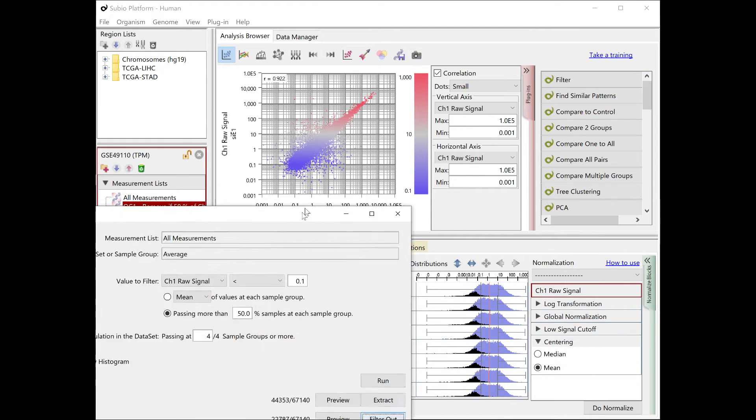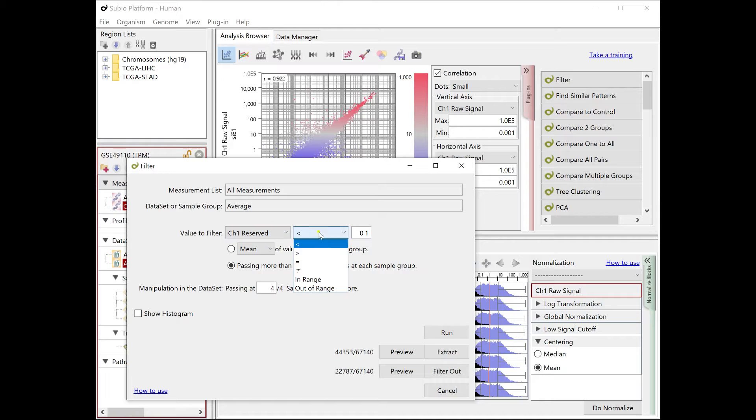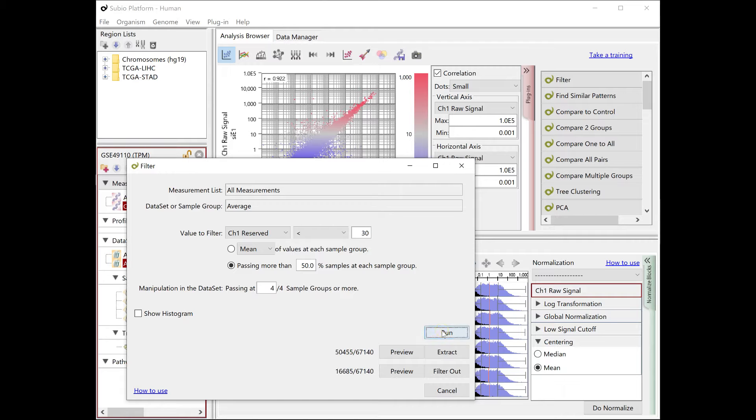If you also have count data, you would be able to remove noise more effectively. Since the threshold is different between TPM and count, adjust it for count data.